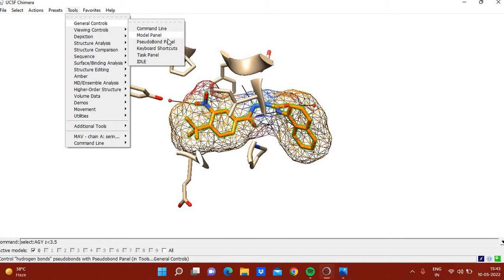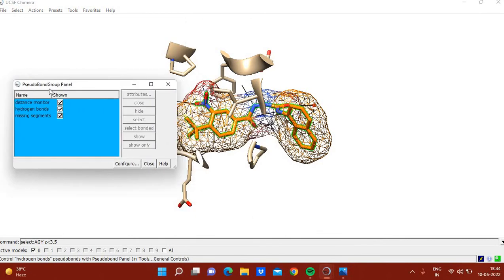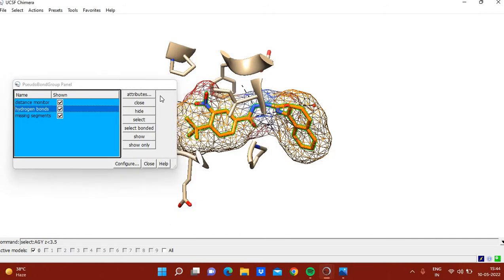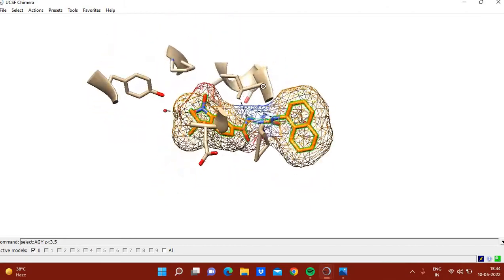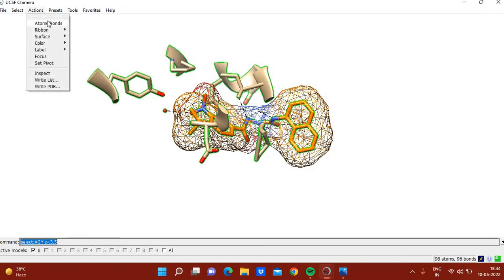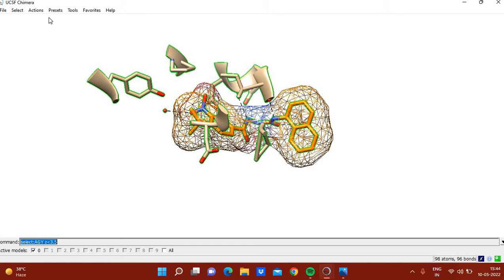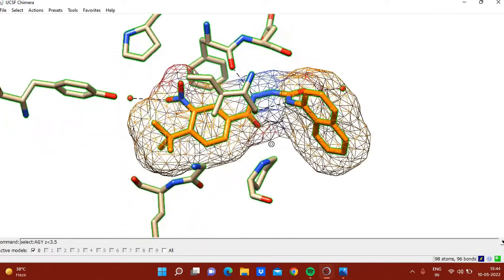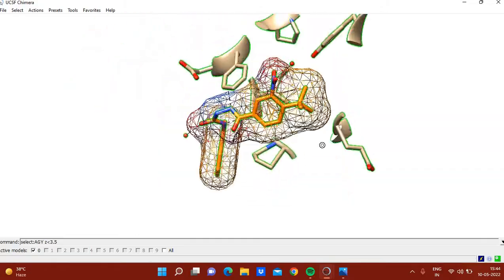To change the representation style of hydrogen bonds, go to Tools > General Controls > H-Bond Panel, then click H-Bond Attributes. You can change the line style to different presentation formats. In this way you can show all hydrogen bonds.